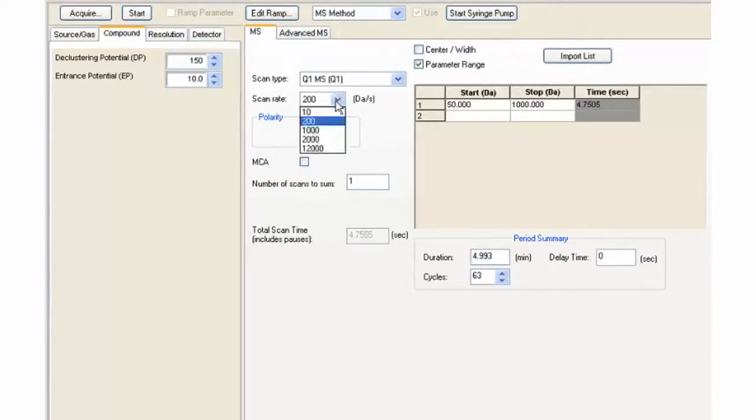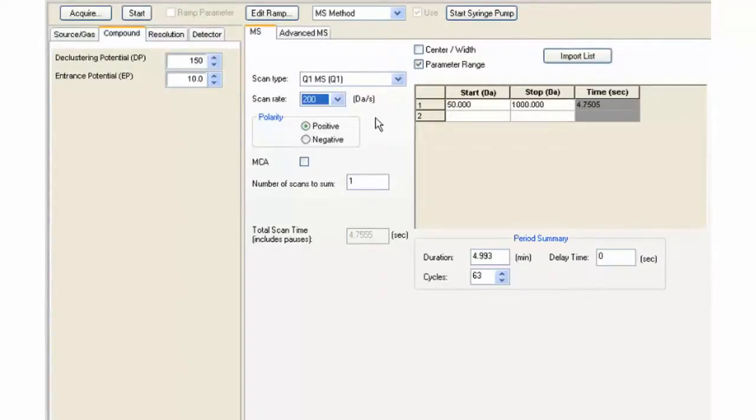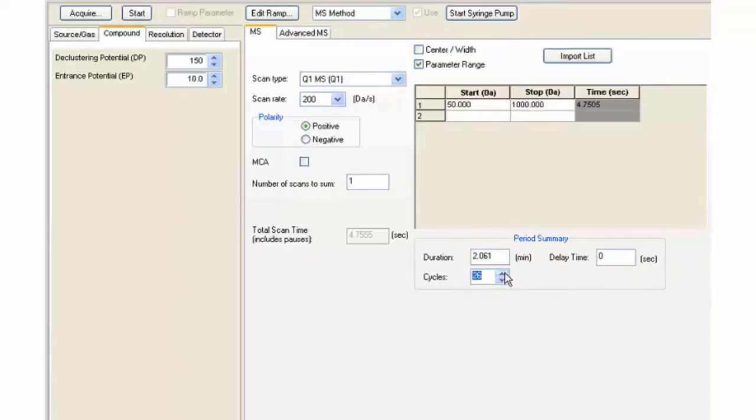The scan rate defaults at 200, which is good for infusion. The duration or cycles can be entered. Notice that the duration and scan time are linked by the total scan time.